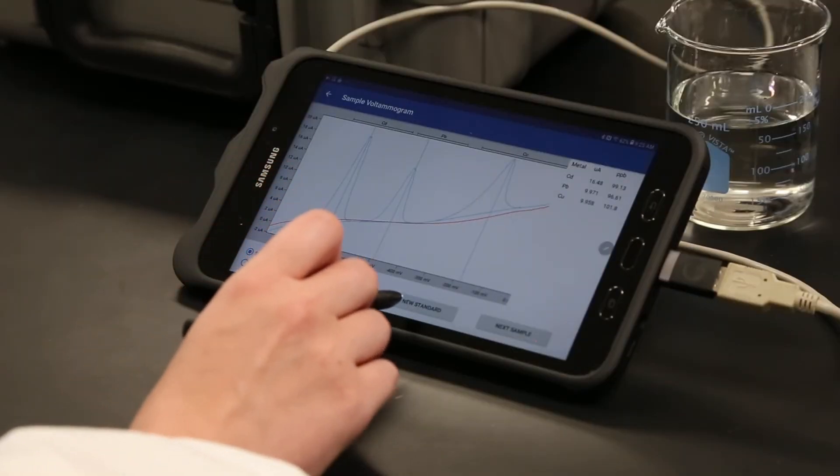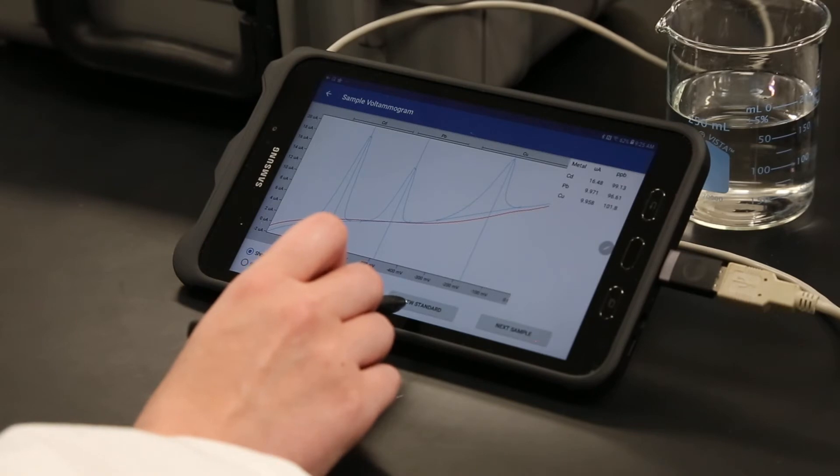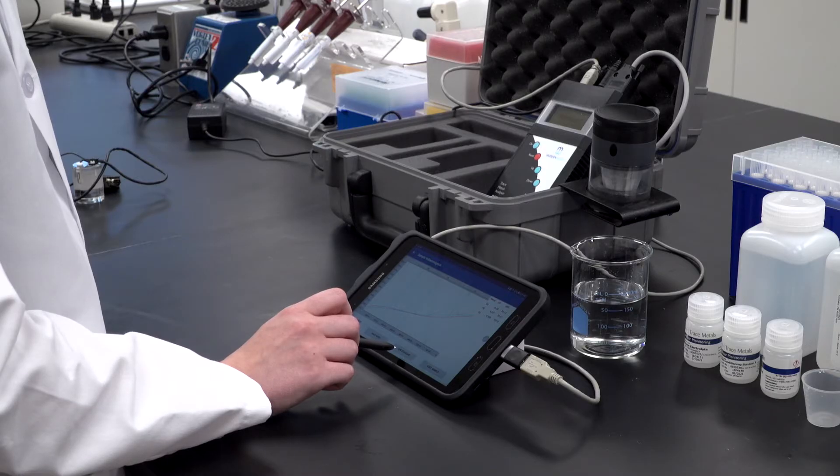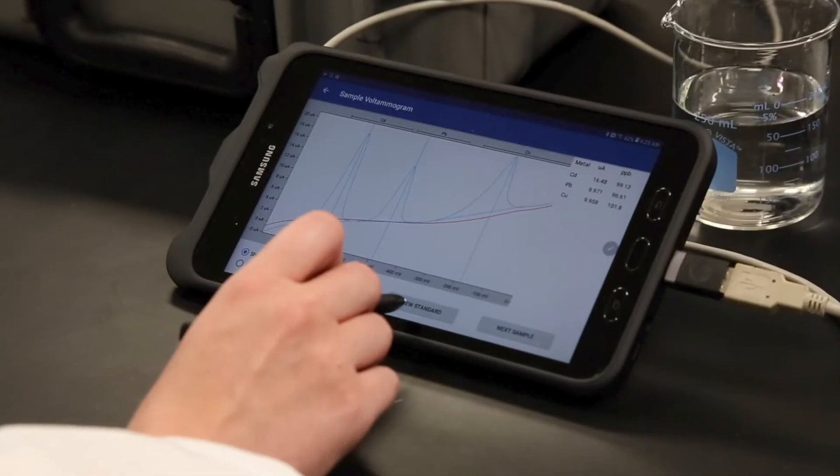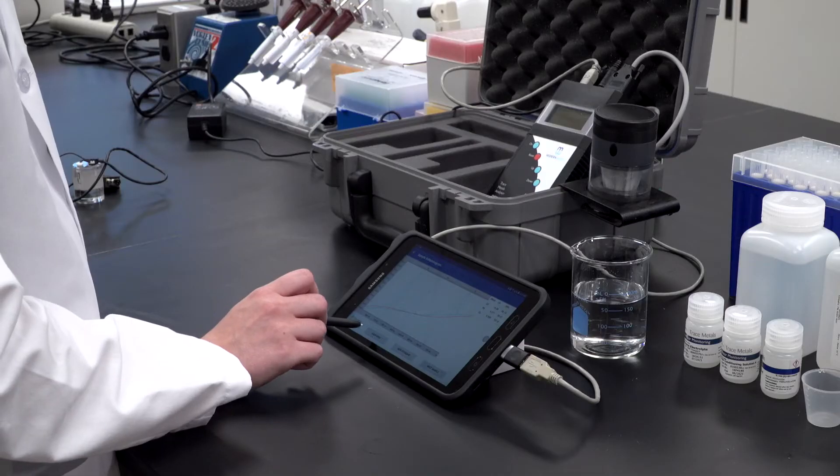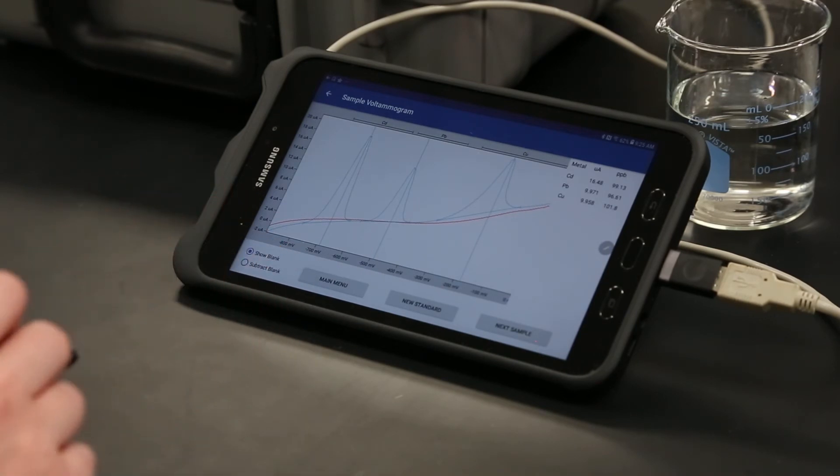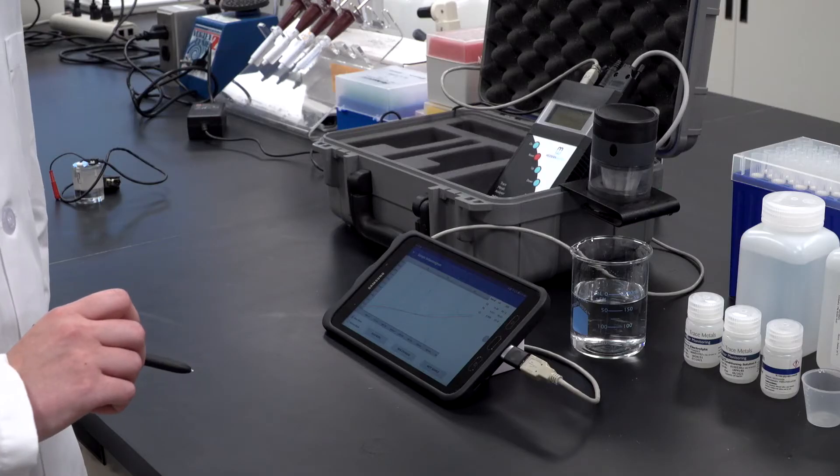Recalibrate for the same analyte metal and concentration range using the New Standard button. It's typically recommended to recalibrate after five samples or if the required concentration range changes. Click the Main Menu button to return to the main page to analyze other analyte metals, change option settings, or use any other functions.